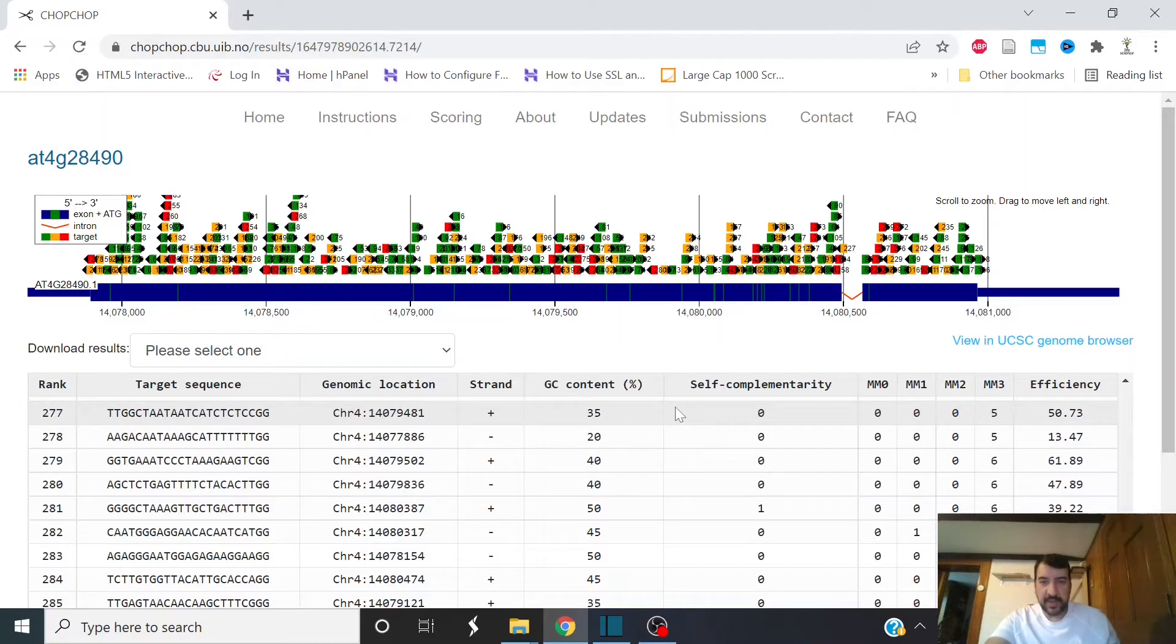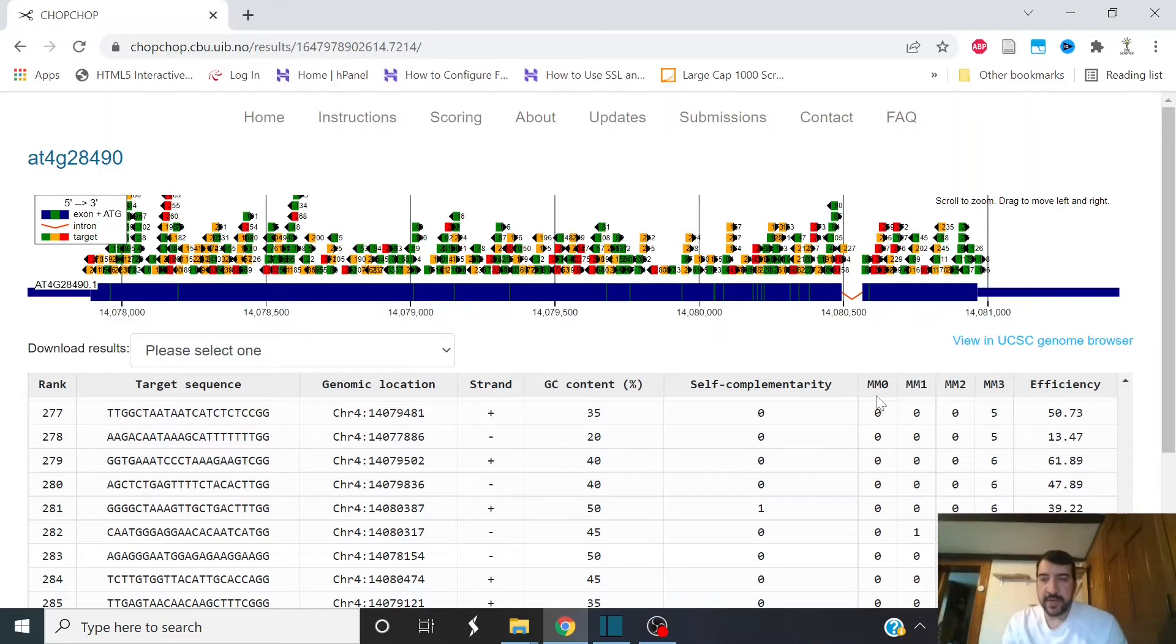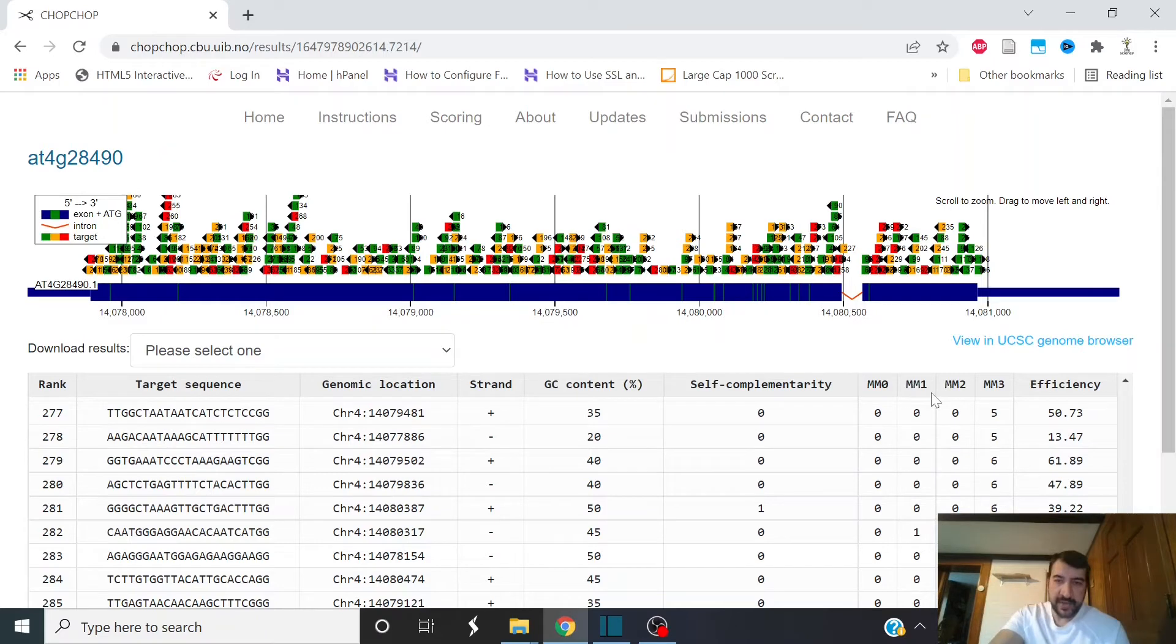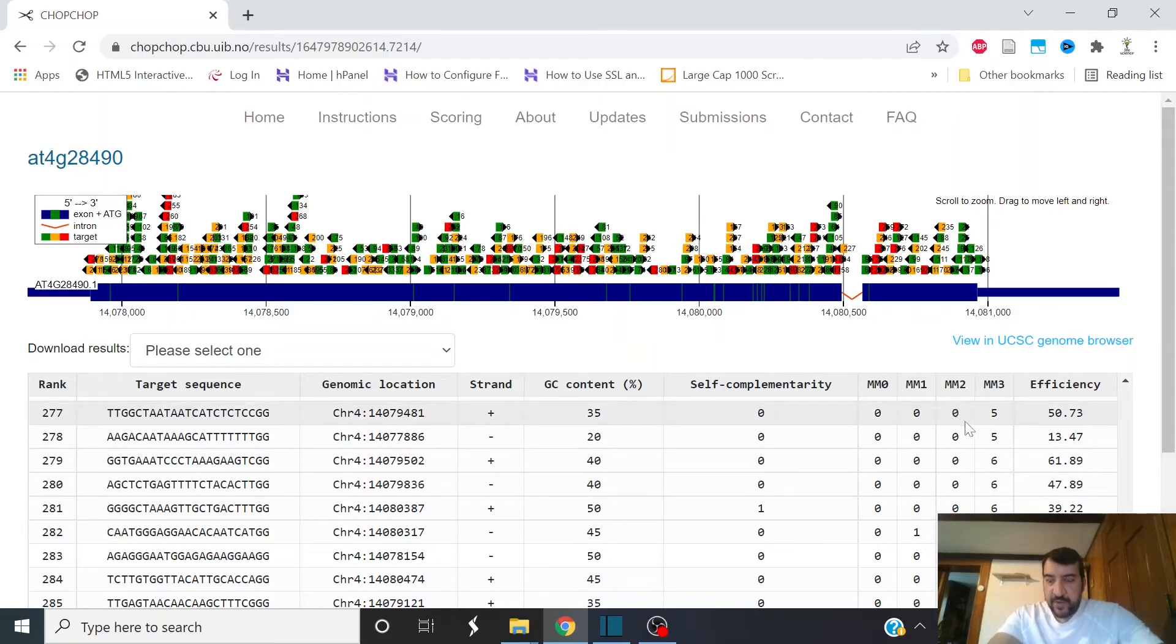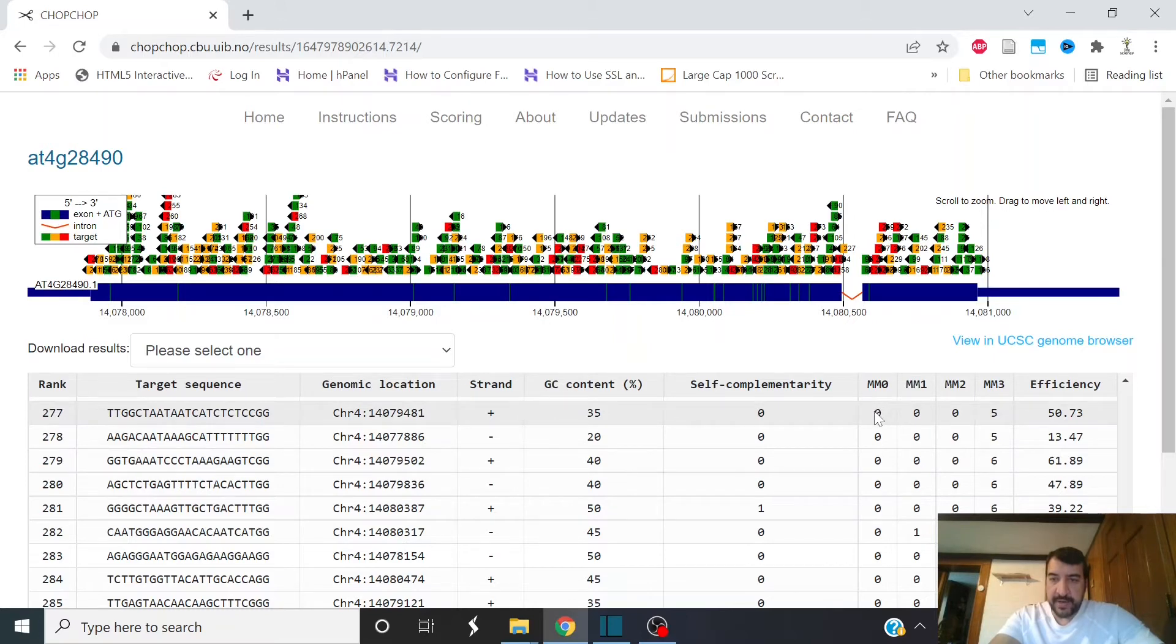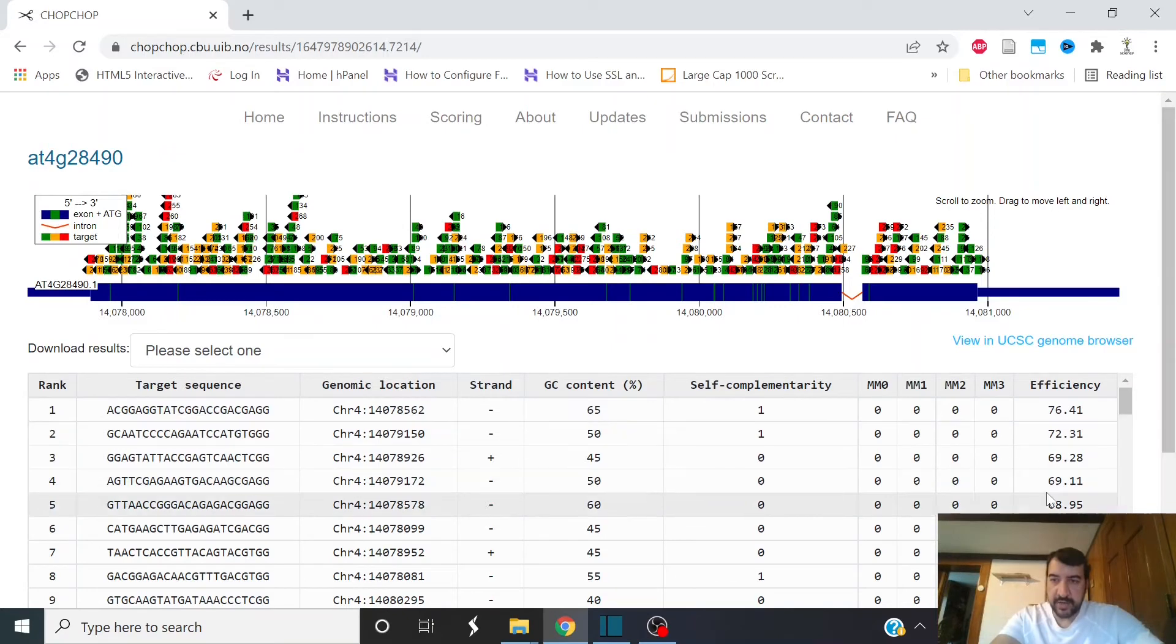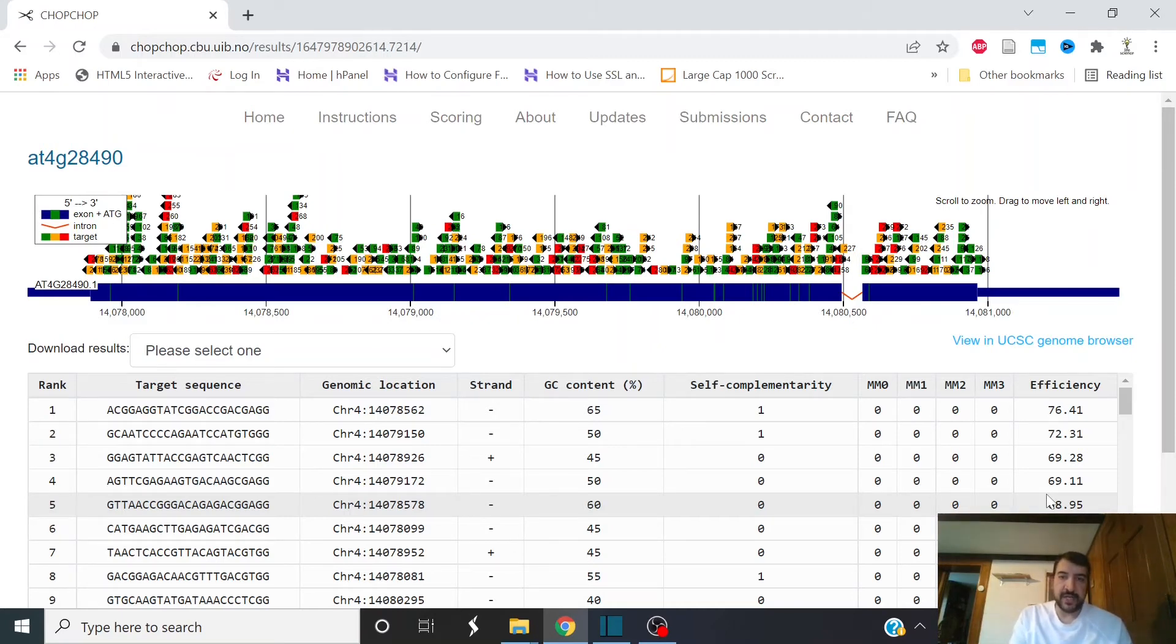ChopChop looks at their off-target effect. So here, MM0 means how many other targets in the genome there are that have an exact match, that have no mismatches to your target. MM1 means how many other sequences in the genome have one mismatch, etc. It's probably okay to have guide RNAs that have a few mismatches, but it's not okay to have perfect matches in the genome to your guide RNA. ChopChop also shows you the efficiency from the Donch algorithm. And so if you want to pick the guide RNAs that can both cut very efficiently and also don't cut a bunch of other things in the genome.